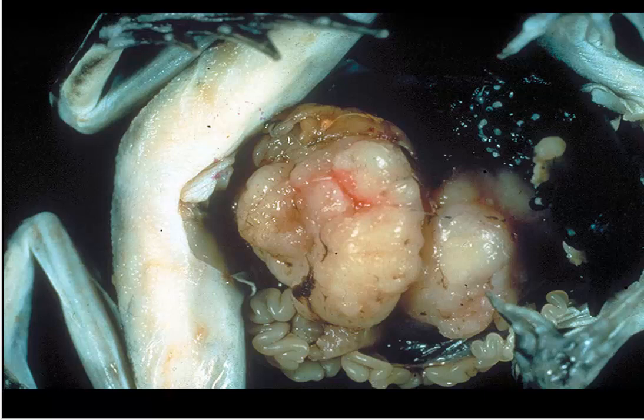But you used to get a leopard frog and you used to dissect it when you were in the 9th grade. And for this leopard frog, I would like you to give me a morphologic diagnosis, an etiologic diagnosis. We're going to trot that old format out. And how about a cause? Okay, time's up.